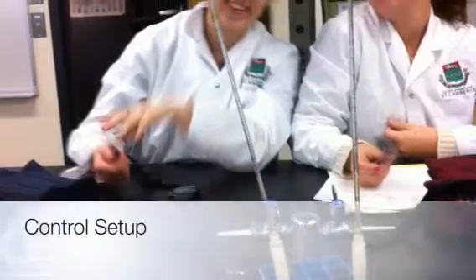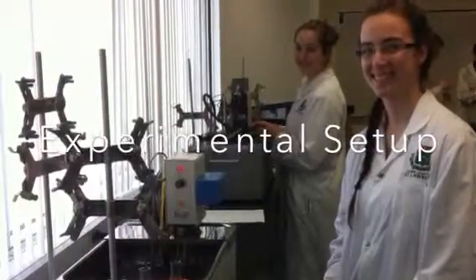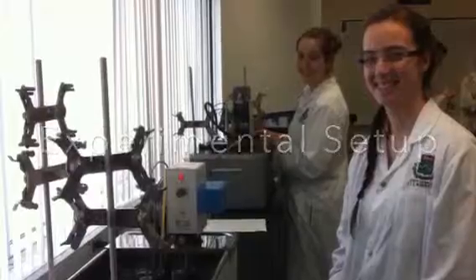While the procedure of the control involved measuring the volume of CO2 produced at room temperature, our procedure measured the volume of CO2 produced at 10, 15, 37, 45, and 50 degrees Celsius.